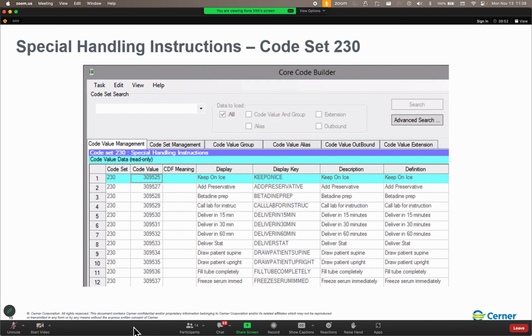So for example, I would have a model experience chemistry, MX Chem, or a baseline West chemistry, BW Chem. And then what that does is for the Vitros 1 and the Vitros 2 and the Chem Auto subsection multiplexer at the model experience lab, those will be associated with the MX chemistry. For the ones over in baseline West, those would be associated with BW chemistry.